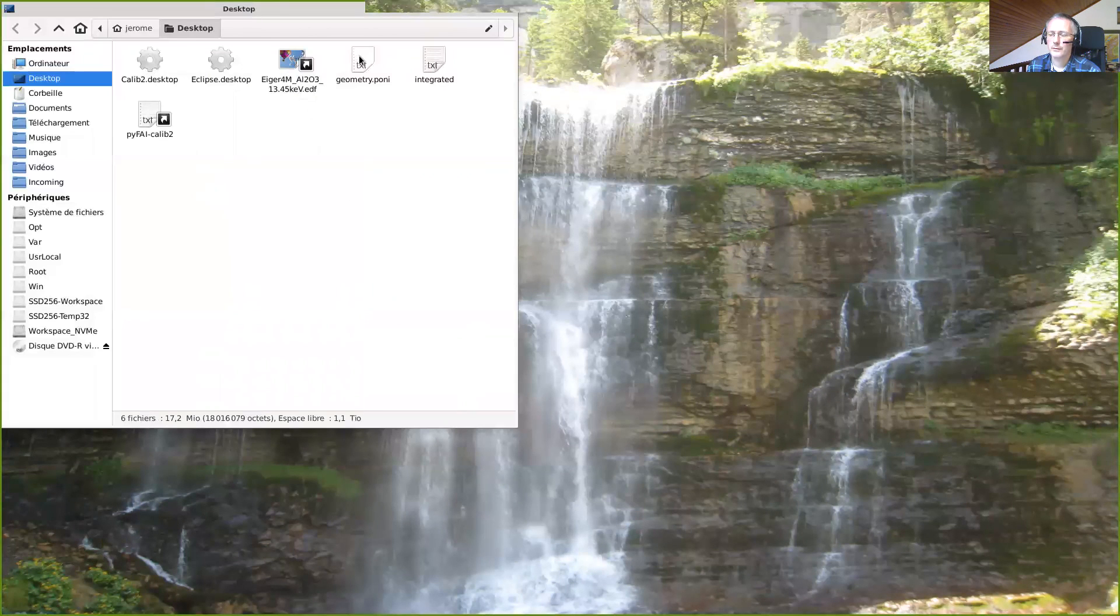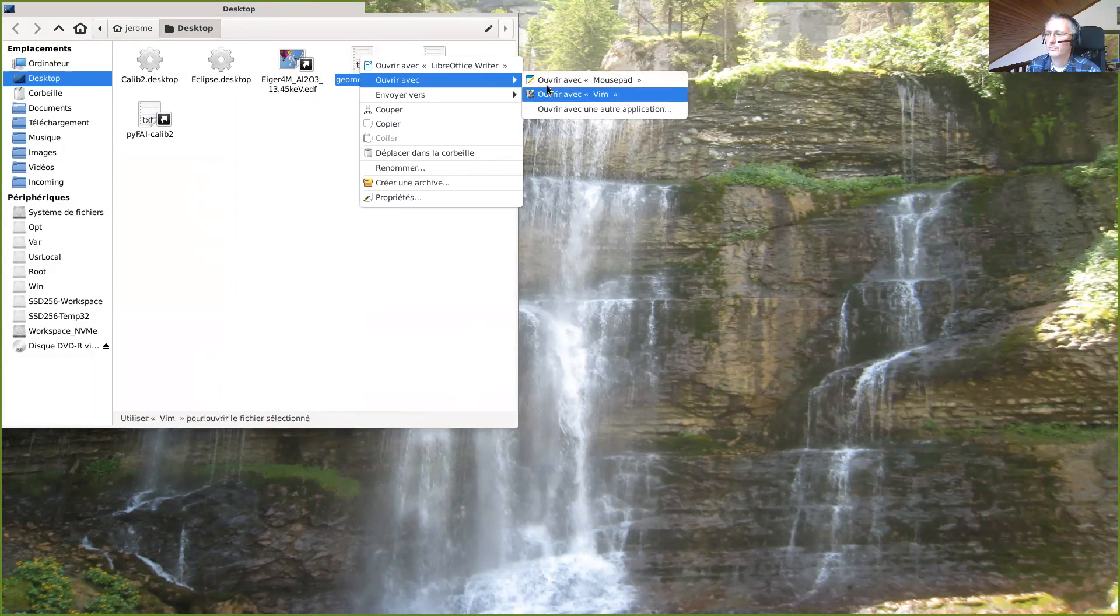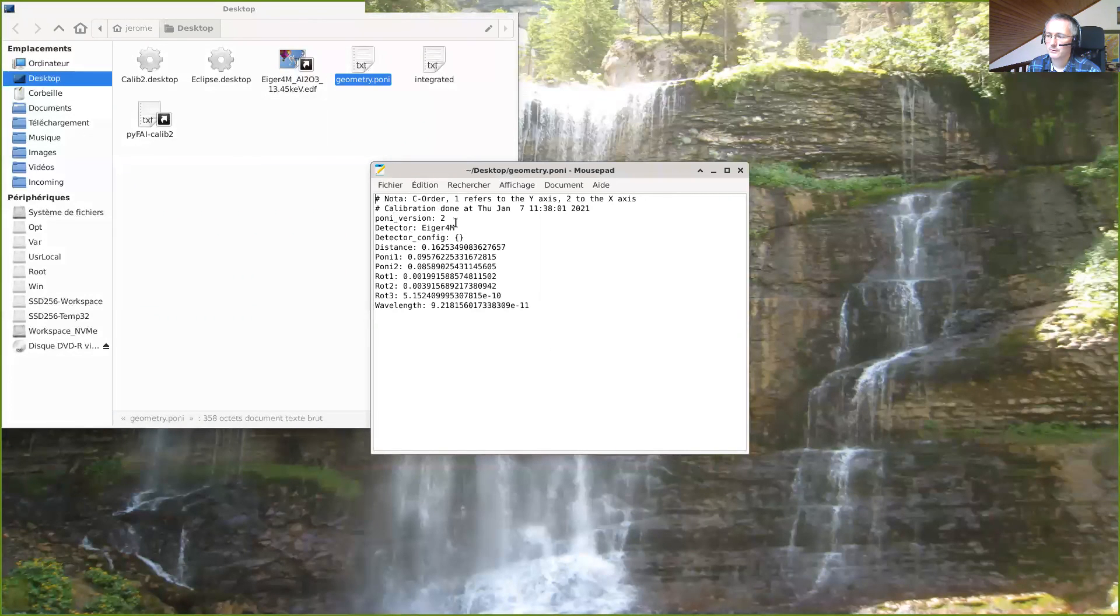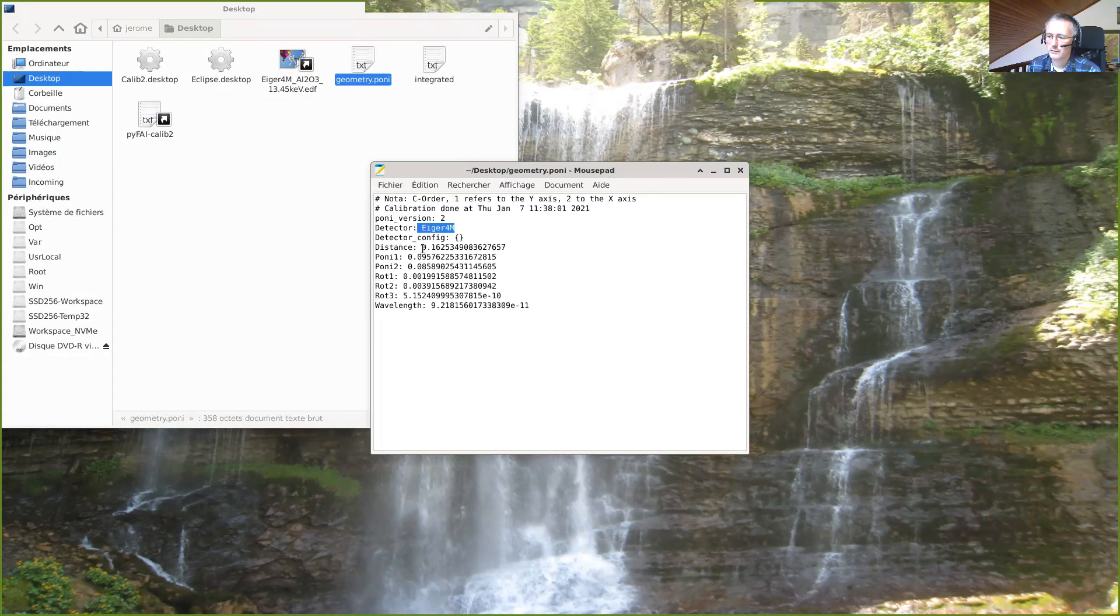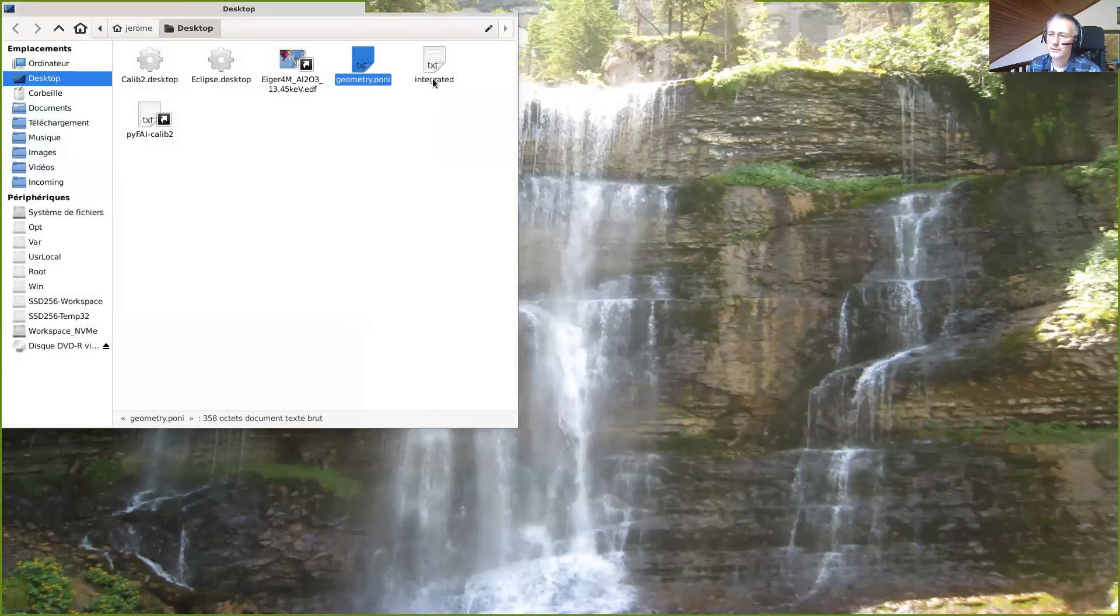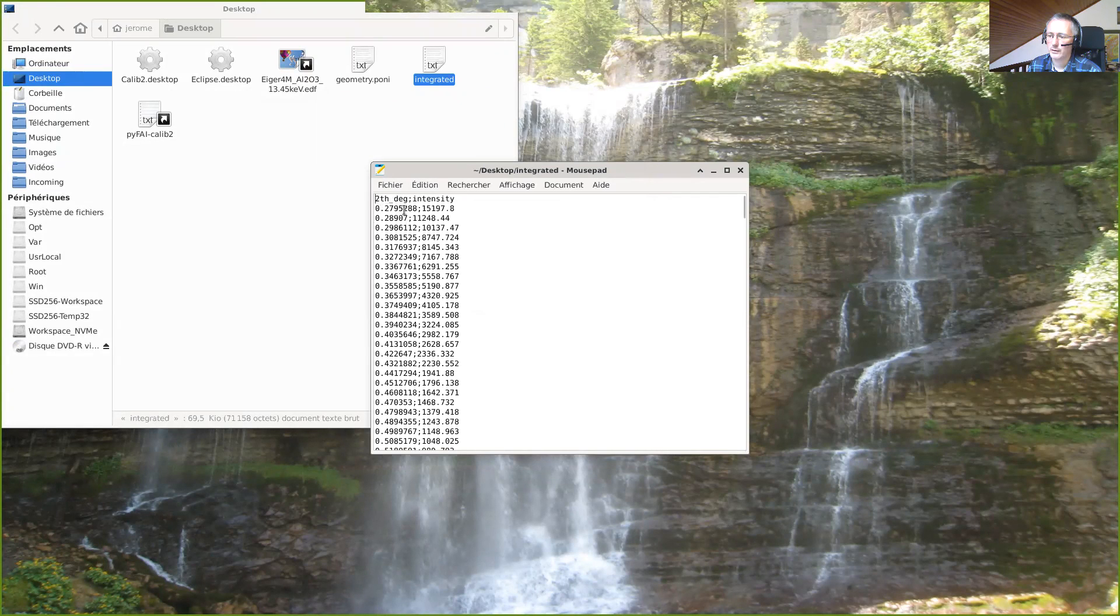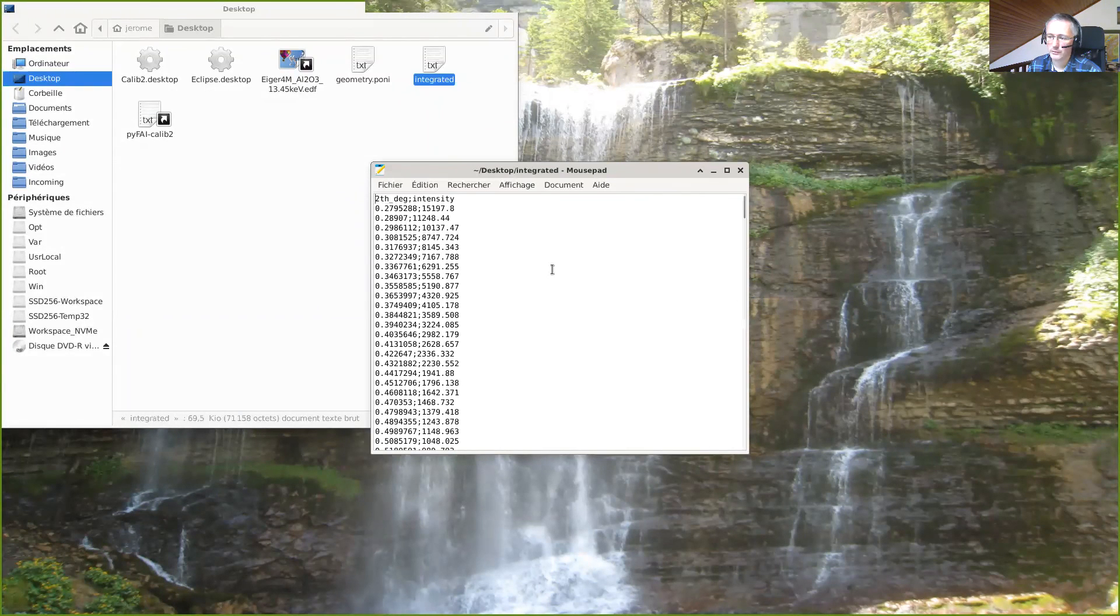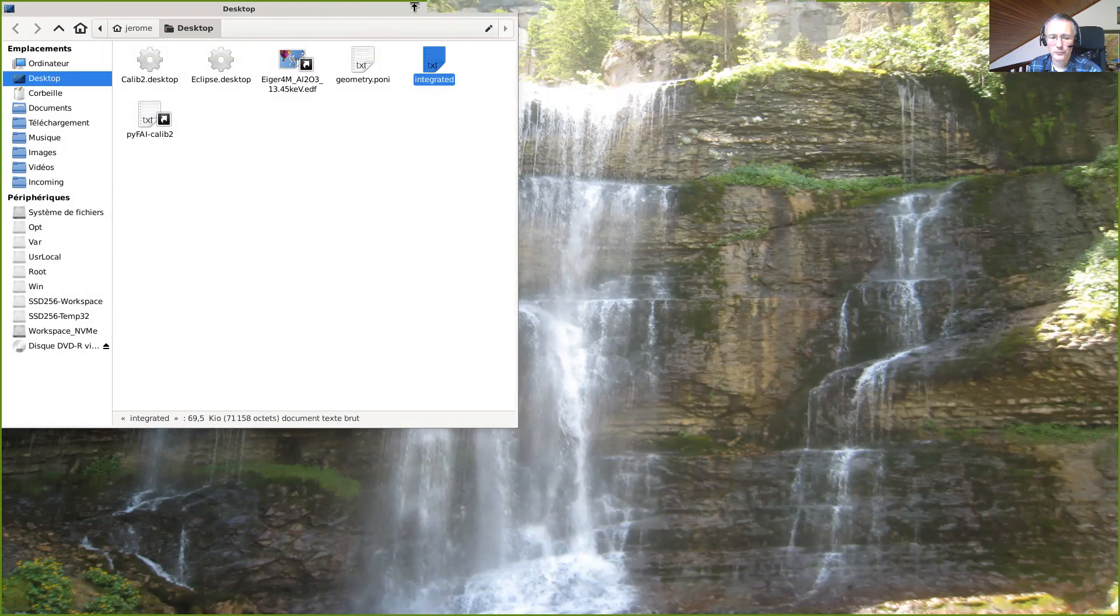And now we have this geometry.pony file that has been created. I will open it with mousepad. This is a very simple text file that contains when the calibration was performed, what the detector was, the distance, the pony position, the different rotations, and the wavelengths used. It's very simple if you want to reuse it. The integrated data are directly available. We have two theta intensity and the values. This can be plotted within the tool you like, you can even use Excel if you wish. With this I thank you for your attention and I wish you a fruitful experiment calibration and integration.